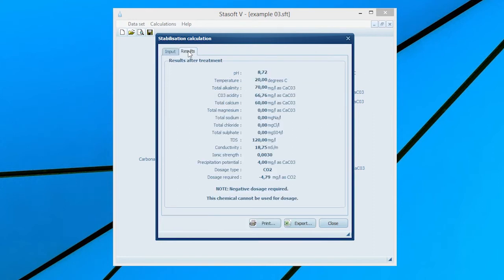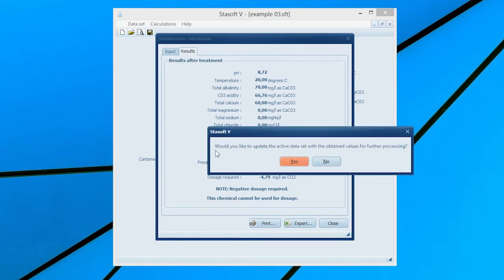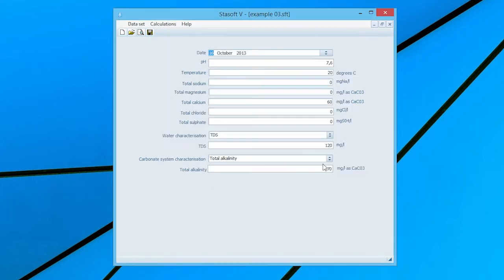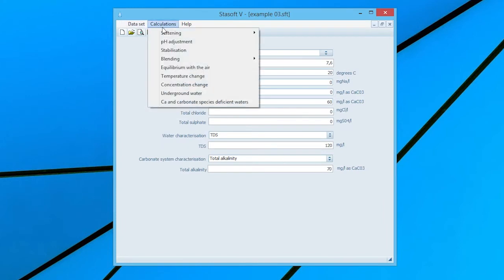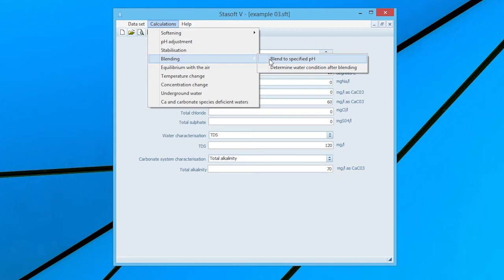Selection of the Results menu option will bring the Results After Treatment window onto the screen with values of the new state of the water and the dosage of lime required to stabilize the water to the prescribed calcium carbonate precipitation potential.